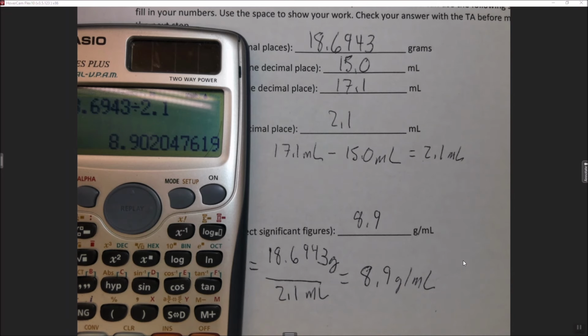One common source of error in an experiment like this is air bubbles, and this especially happens with plastic graduated cylinders. So if you're experiencing some air bubbles in your graduated cylinder, a good thing you could do is just gently knock it onto the countertop, and that will dislodge any air bubbles. Note that air has a very low density and will certainly have a much lower density than your metal. So having air bubbles can throw off your experimental results. Do what you can to minimize the air bubbles in your system.